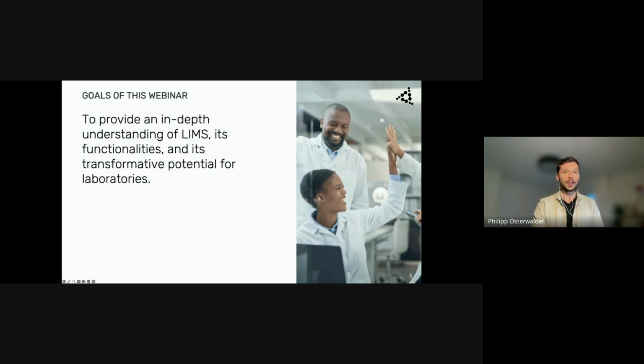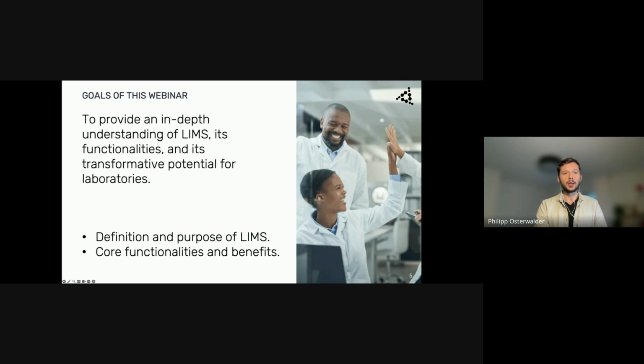Let's start with the webinar goals. One overarching goal is to provide an in-depth understanding of a laboratory information management system, its functionalities, and its transformative potential for quality control, quality assurance, and service laboratories. One of the main topics of today's webinar is the definition and the purpose of a LIMS, and the core functionalities, the usage and the benefits of a LIMS.